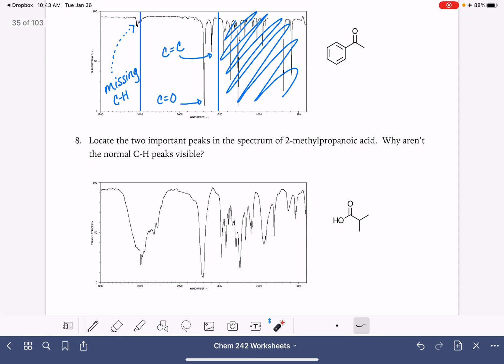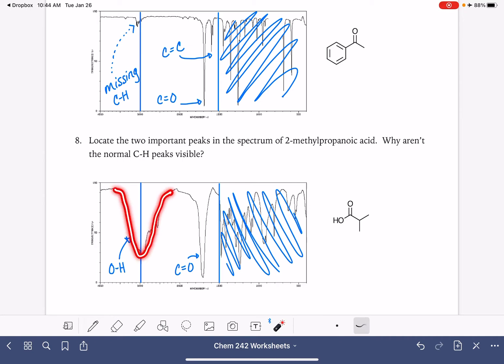Here we have a carboxylic acid. We're looking for two important peaks in the carboxylic acid. So let's draw our lines right there. We have, first of all, a very normal looking carbon oxygen double bond peak. And then we have this really broad peak. So these broad, very dominating, you know, in terms of size, that's always an OH group. There isn't anything that has the potential to spread out like an OH group. OH groups are not always this big and this broad. In fact, we saw an example on this particular worksheet where it was quite a bit shorter and it was also pretty well isolated to the left of the 3000 line. So there's a lot of variation in what we expect to see for the OH group, but regardless, they're just massive. They're just really wide.